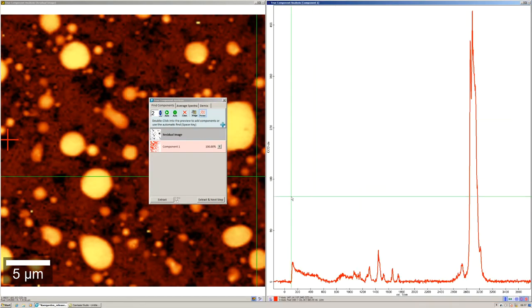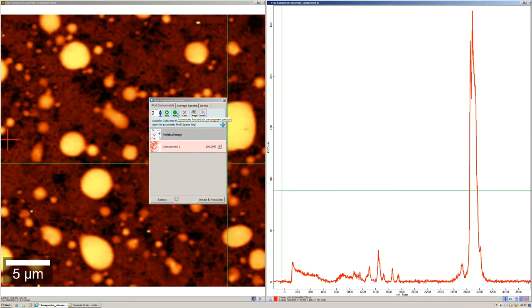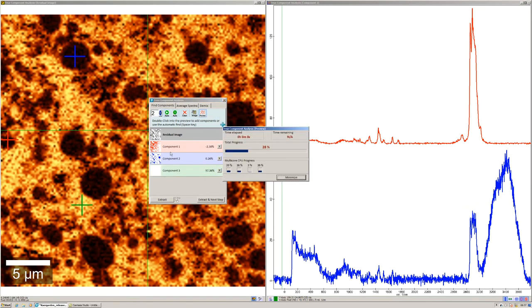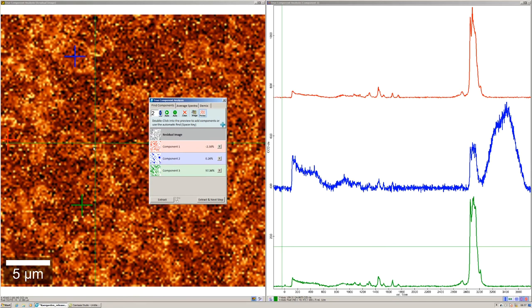So we simply add an additional component. Now we still see some structure therein, and thus we add automatically another component. Now we are at a situation where we virtually only see noise. Here our three components are shown.